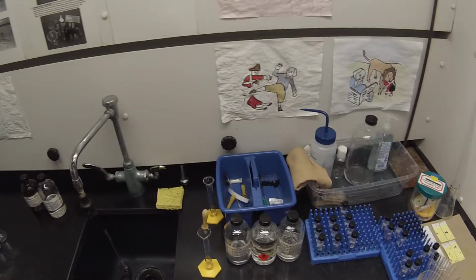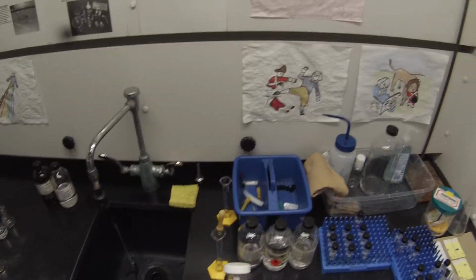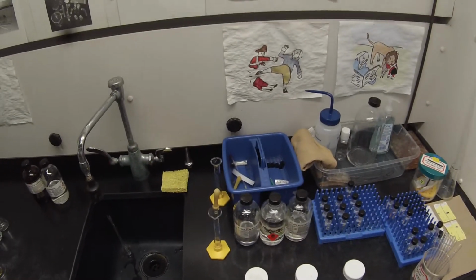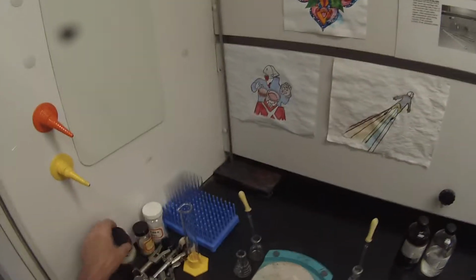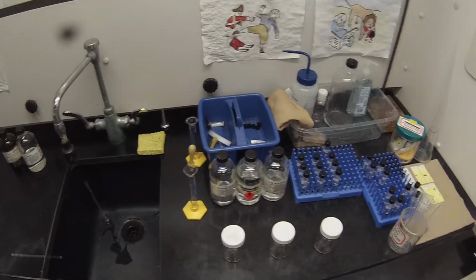It's been reported in the literature that vanillin has been run on column chromatography in a mixture of 2 to 8 ethyl acetate and hexane or petroleum ether, or a 1 to 5 mixture of ethyl acetate petroleum ether. Generally, for thin layer chromatography, you want a mixture that is a little bit more polar. The RF values, or how fast the compound moves, is dependent on how much water there is. And chromatography silica, which is in a jar like this, is generally a little bit more wet than the thin layer plates, which means everything moves a little faster. So we want to increase the polarity when we're running on a TLC plate.